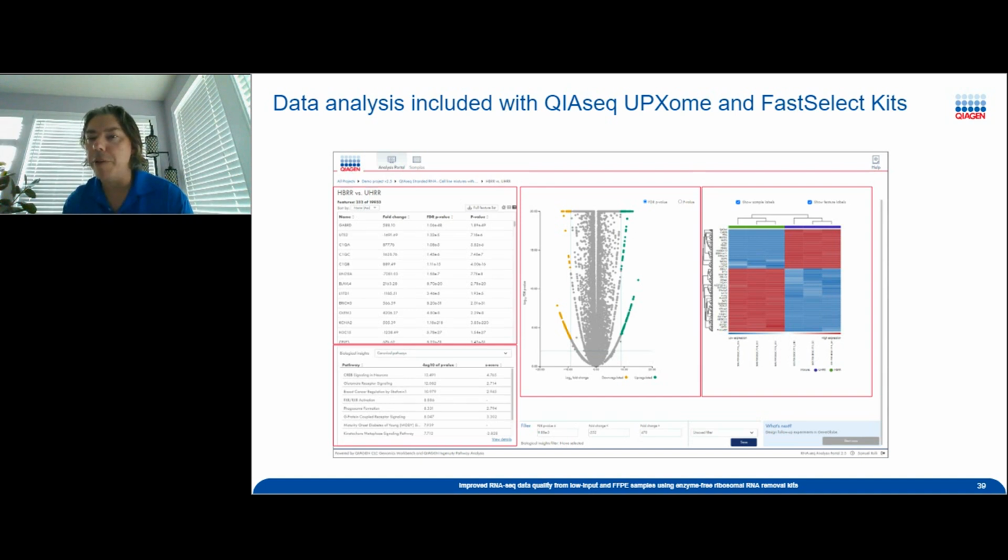The lower left-hand corner is pretty cool. This is coming from Ingenuity Pathway Analysis. If you're not familiar with Ingenuity, over the last 30 years, scientists have been reading papers, and a lot of the published values, the directionality, and genes that interact with other ones in pathways or individually, have been curated in this database here. As you put the samples together to do the experiment, at the point where we have the differential expression, we send it off to Ingenuity, and Ingenuity returns the results. And with those results, we have different pathways that are shown based on this gene expression dynamics here.